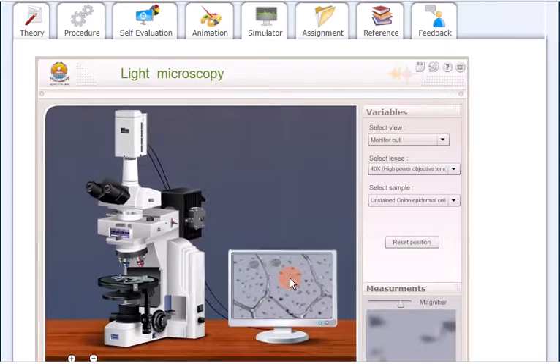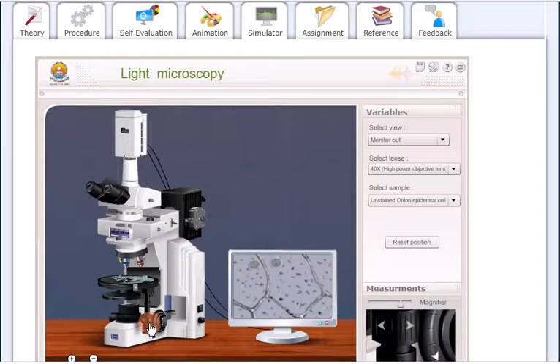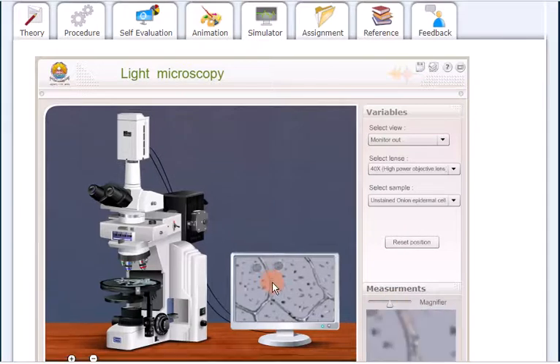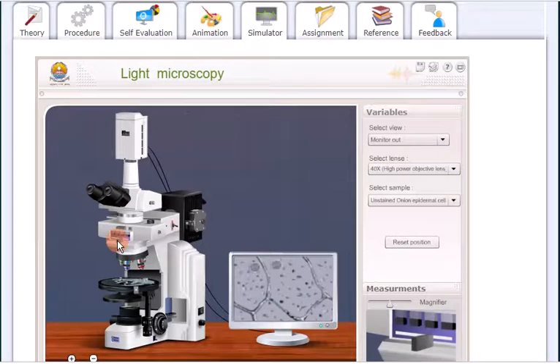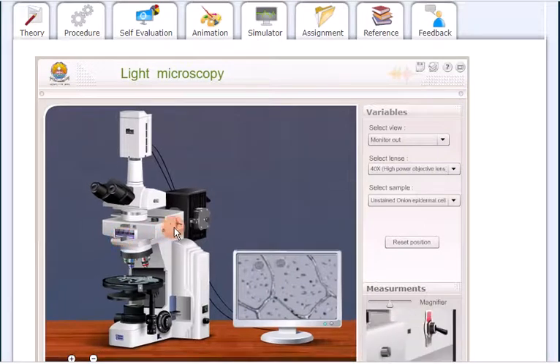And if you would like to move this object, you can move these, which is this. I'm not sure about this small plus minus, but you can see these slides. I'm trying to look at if there is any tool that I can use.